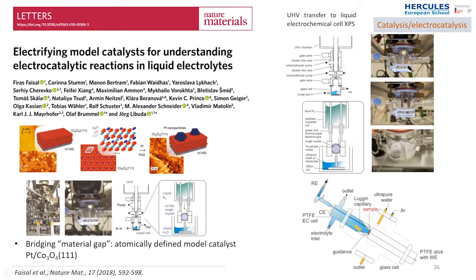You can conduct the electrochemical experiments, measure linear sweep voltammetry, cyclic voltammetry, and this is actually connecting the sample, because you are taking the sample from the vacuum and you need to connect it to get in contact with liquid. So you have to fill it with some inert gas before you are actually taking the sample in. So that's how it was done.